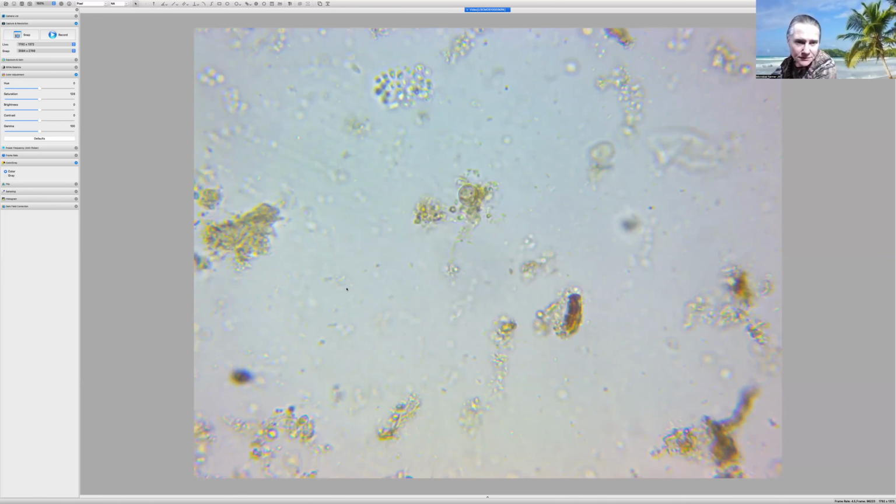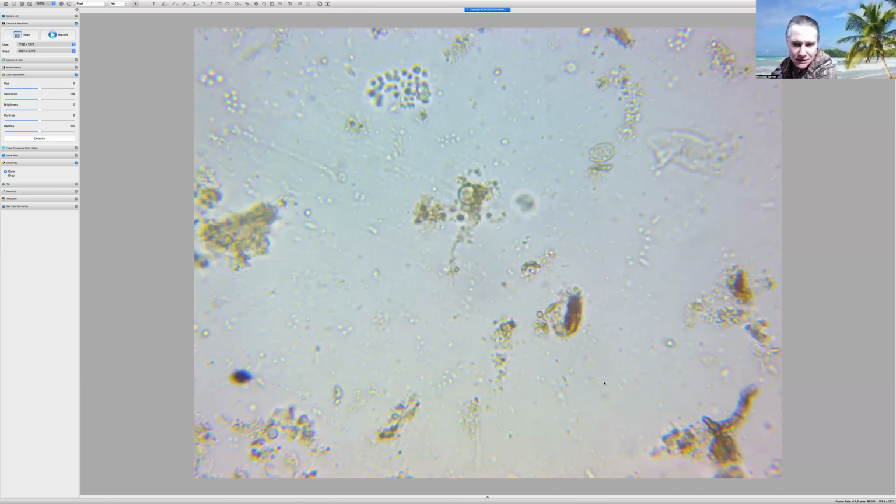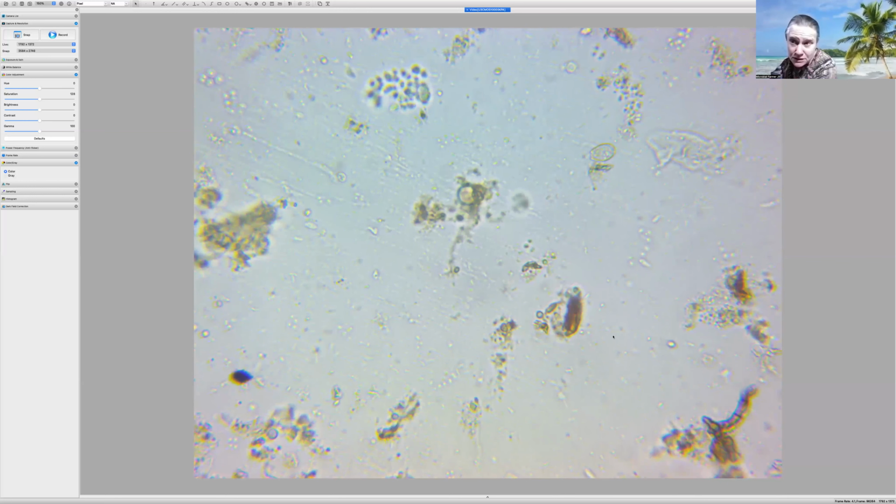Even though there's this many, what you would need to do with this sample is send it in to have a DNA analysis done, and it will tell you how many different species, through electrophoresis. Here, I think there's 2 of them teamed up dragging this aggregate around. So that's what our protozoans do. They call them the furniture arrangers here. And these are our aggregates.